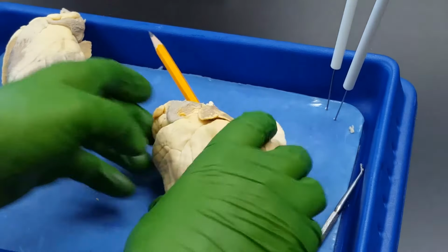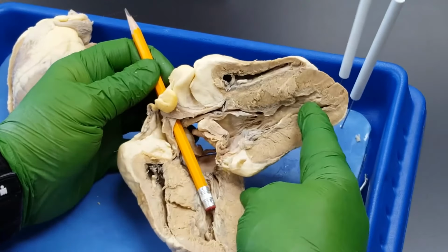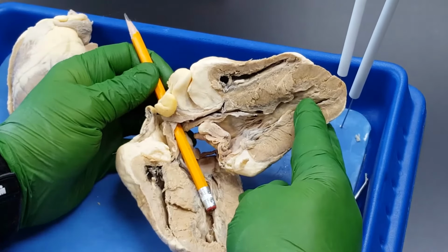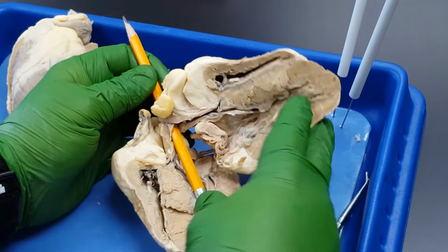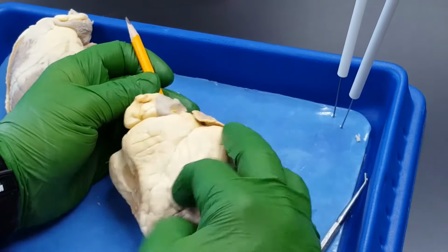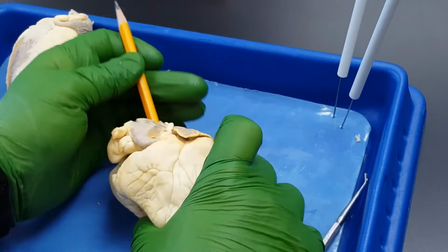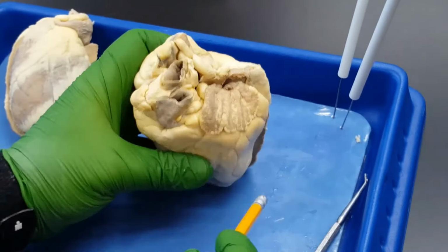This is what tells you the great vessel that you have: what chamber the pencil or the pipe cleaner or the probe ends in. This is the left ventricle right here where I'm tapping with my thumb. So that makes this great vessel the aorta. Let's try it with the other one on the front side of the heart.